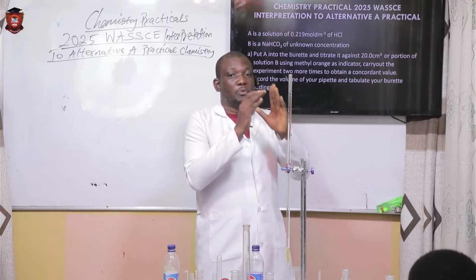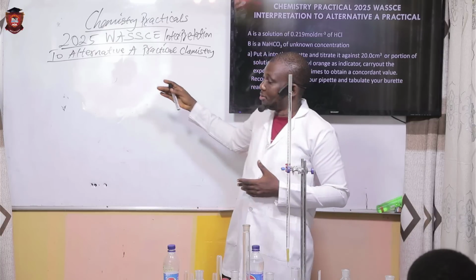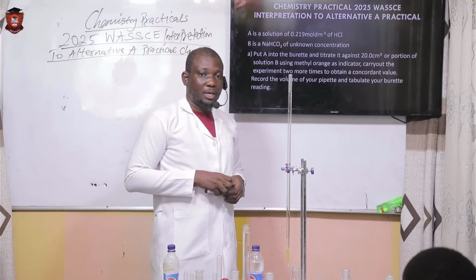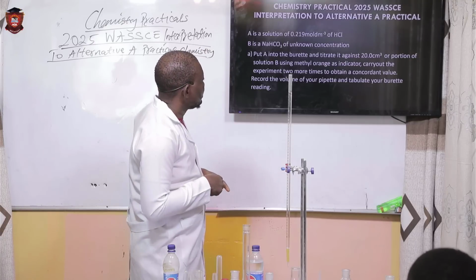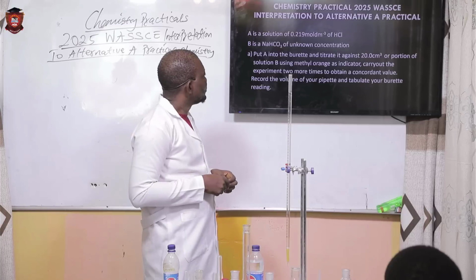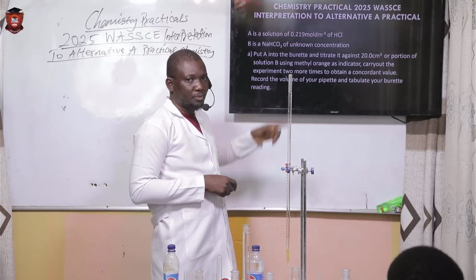Before you take your initial reading, you must go to your question paper or answer booklet, and ensure, if you look at the question, it made mention of recording the volume of your pipette. Yes, record the volume of your pipette.